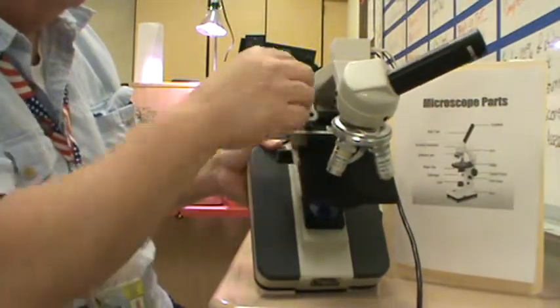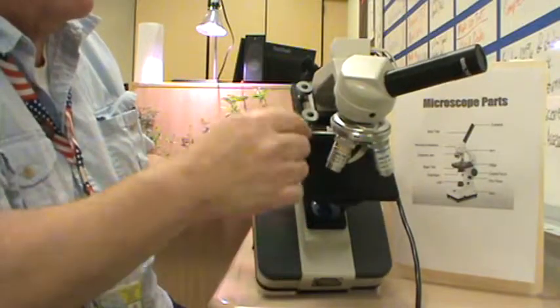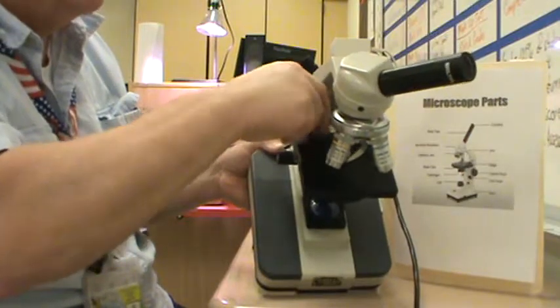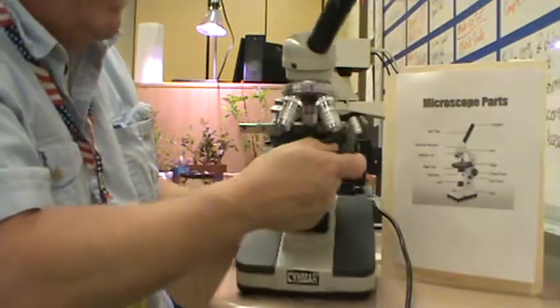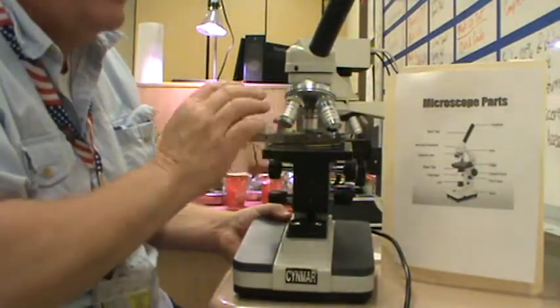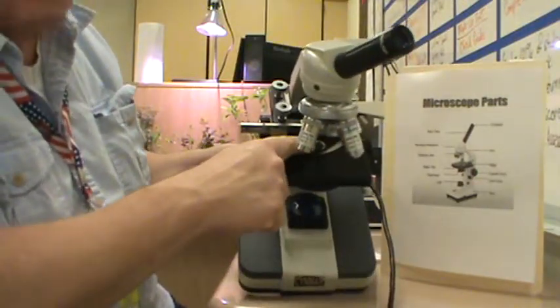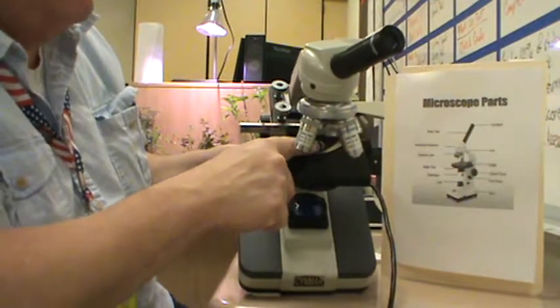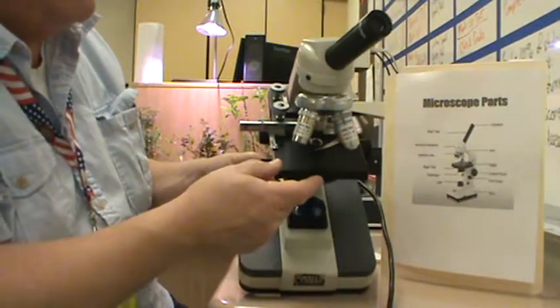I have 2 controls here. I can roll the slide forward or backward across the stage, or up and down stage, I guess if we're going to speak theatrically. And then I can go from stage left to stage right using this controller. On the old-fashioned microscopes, you would simply slide the slide until you had it positioned under, or over, sorry, this right here, which I'm going to call the aperture. I'm not sure the exact technical name. I'm going to call this the aperture, the opening in the stage that allows the light to come up from underneath.